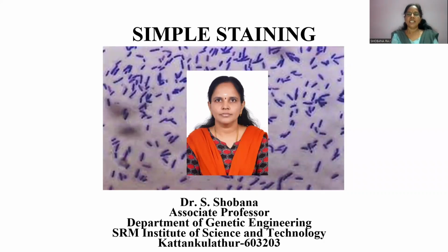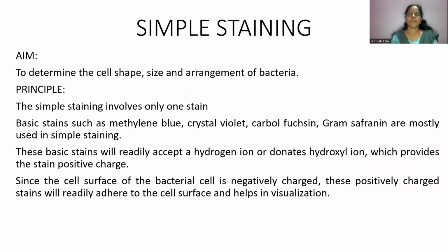Welcome to Microbiology Lab. In today's lab session, you'll be learning about simple staining. So the aim of this experiment is to determine the cell shape, size, and arrangement of bacteria.